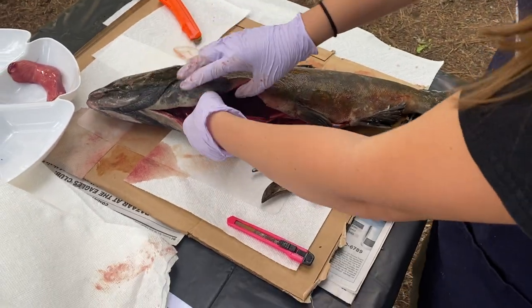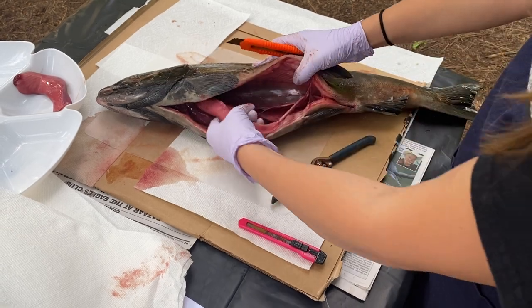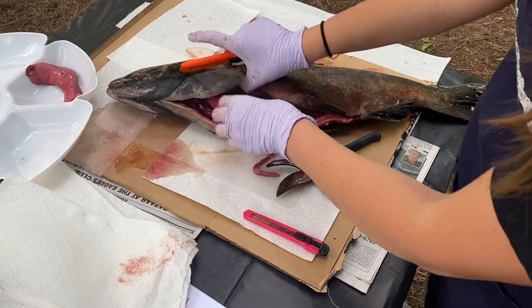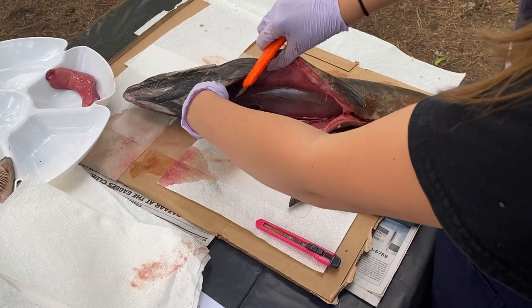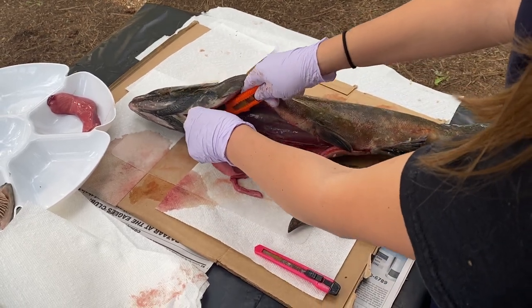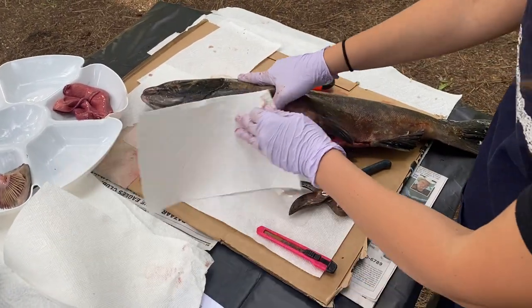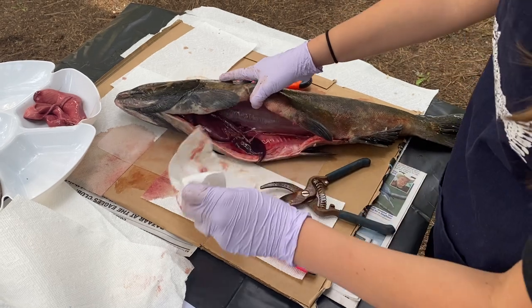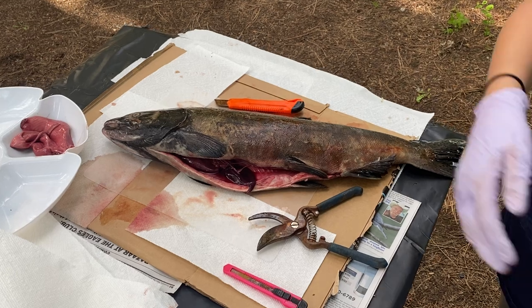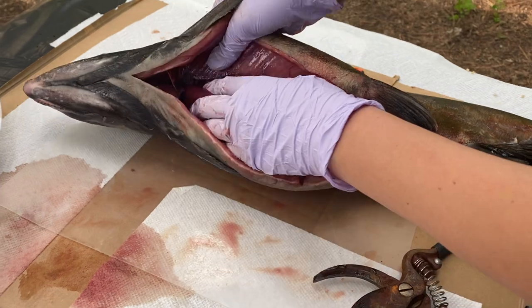So now I'm going to cut the milt sac out first and then we'll explore the liver. You can see the milt sac goes all the way along, and you can see that it connects all the way at the vent. There are two milt sacs. So now we can see the liver in here. This is a really big red organ.